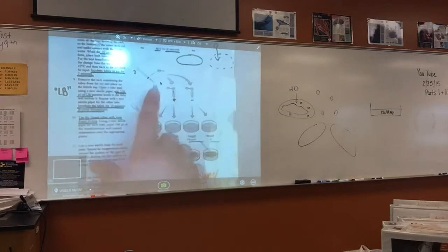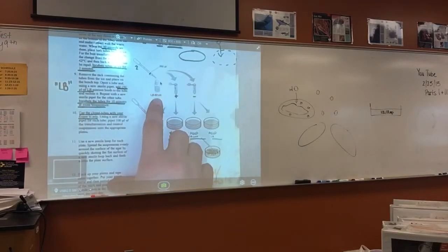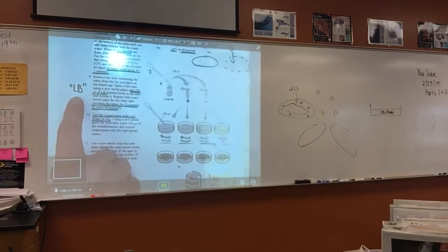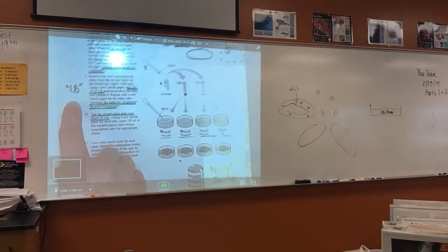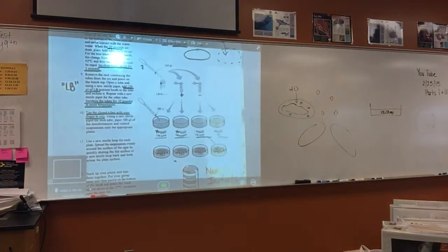All right. The next step, it says here, you're going to add LB broth up to 250 microliters. Again, it looks like you're going to get a big old vial, but I'll have a fourth little micro test tube. It's going to be labeled LB. So you're going to have one of these in your setup that's labeled LB, and that's where you get it. And notice it's the same spot, 250.